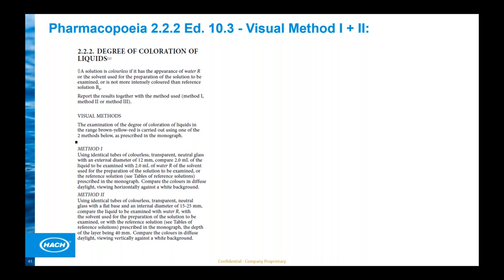With your eyes. Is there a way to set this within the instrument with the color comparison on the LEQO, or how do we define what delta E is acceptable with the instrumental measurement? What is acceptable is a definition of the user. What does the customer accept? The instrument can measure for sure delta E 0.1. That's no problem for the instrument from the technique and so on. But the definition of what is acceptable is done by the user or by the customer.